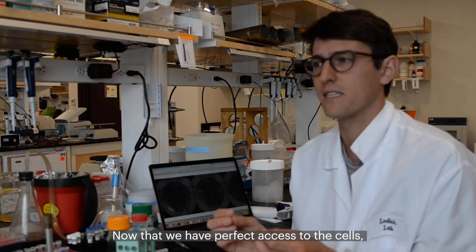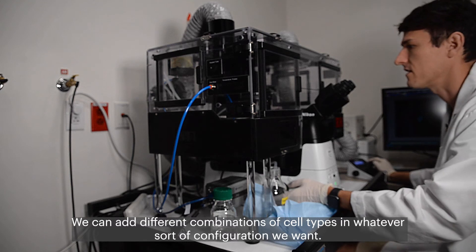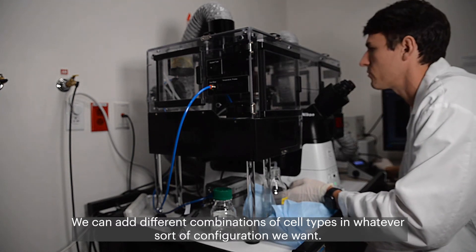Now we have perfect access to the cells. We can image them as much as we want. We can add drugs whenever we want. We can add different combinations of cell types in whatever sort of configuration we want.